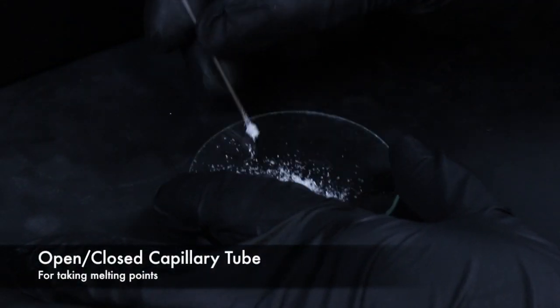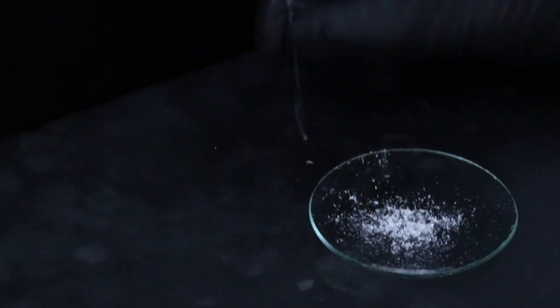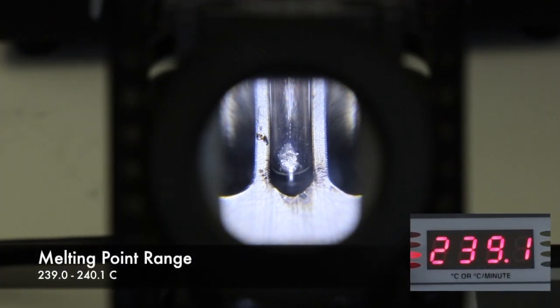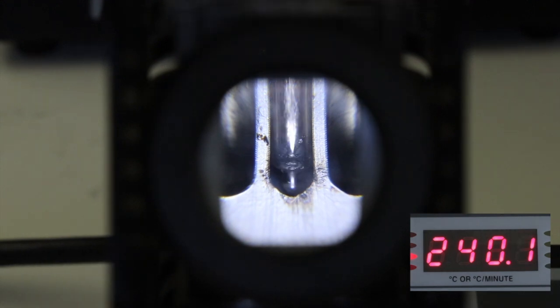Now I can characterize the product, so I'll put some in an open closed capillary tube to run a melting point. And we see the crystals start melting around 239 degrees Celsius and finish around 240.1. So it's a little lower than the literature value, so there's probably some contamination.